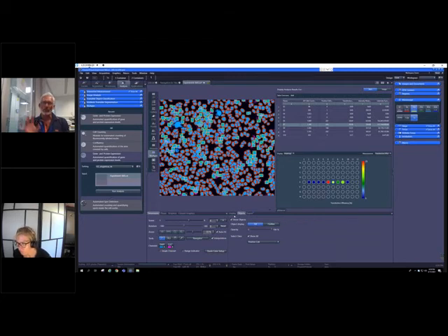You can zoom in and out, and everything will get handled at the end in a single file. So all the data are still in context and nothing is going amiss. This, if you like, somehow replaces your logbook. So you don't need to be aware all the time what you did and what sample and what the naming was and everything. It's one file.